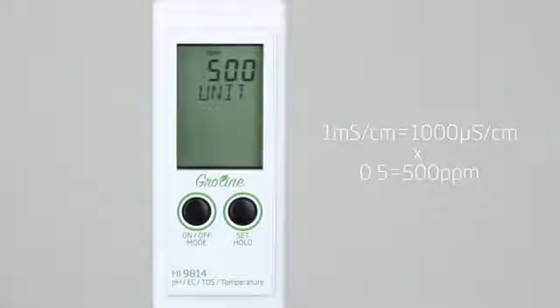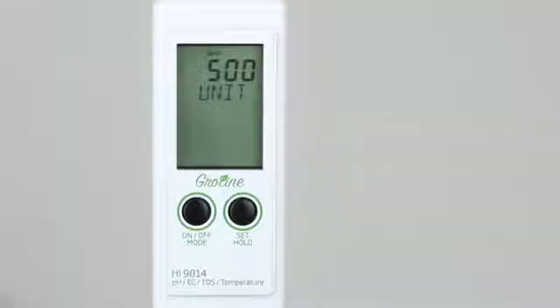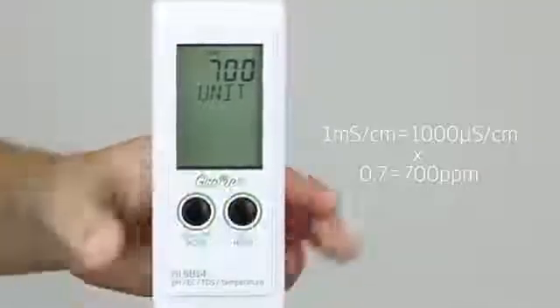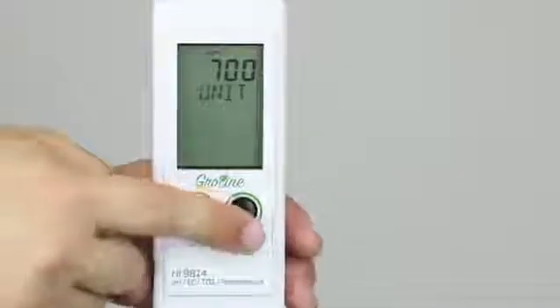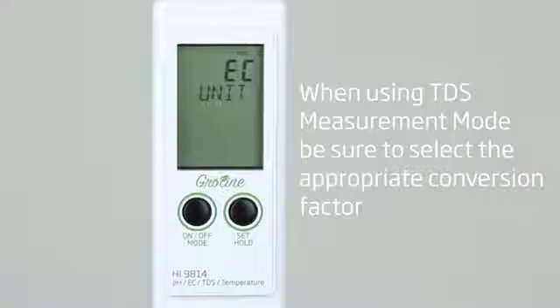500 unit is then displayed for showing concentration readings using a 0.5 conversion factor. Pressing set again shows 700 unit for a 0.7 conversion factor. Pressing set again cycles the measurement option back to EC unit.